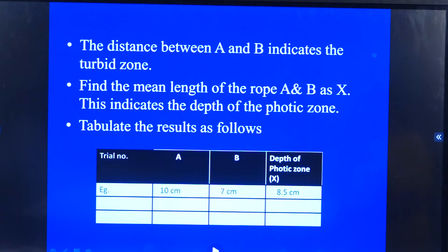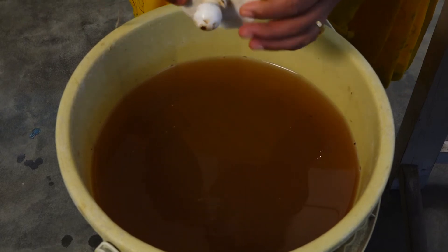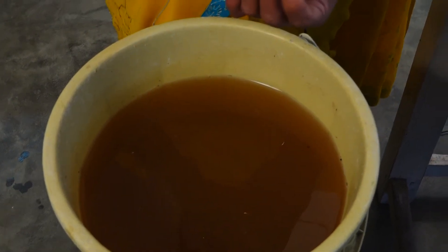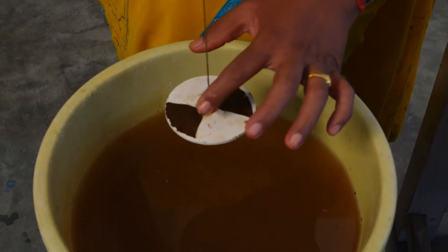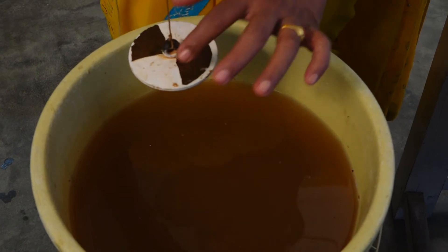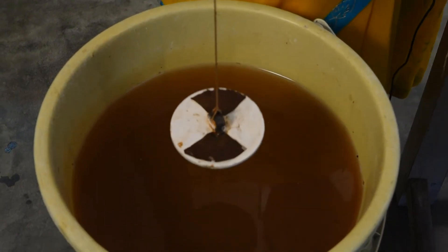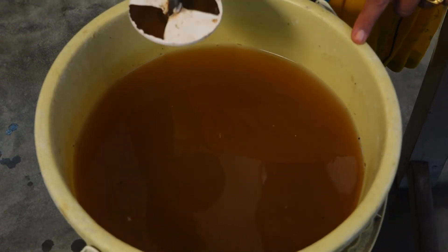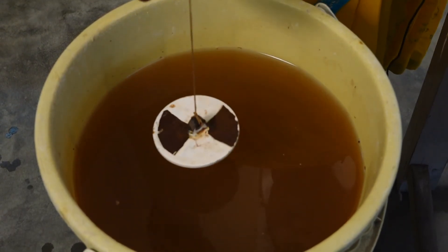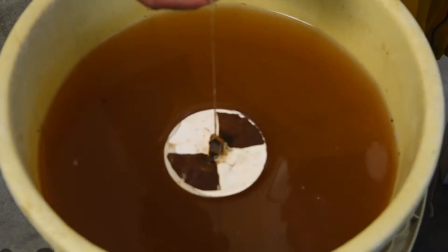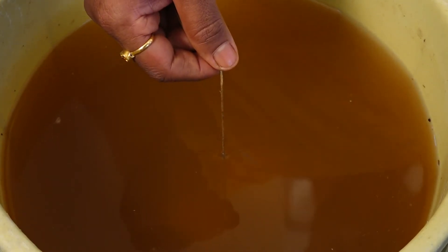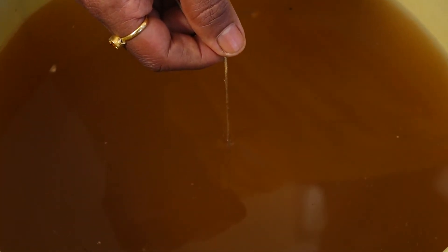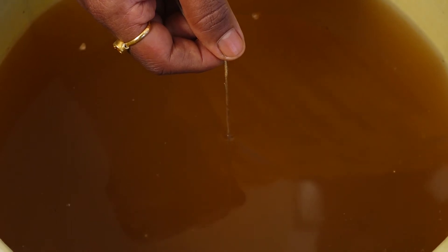We shall be conducting the experiment now. This is the Secchi disc — can you see? To one of the ends we have added the weights, and on the other end is the nylon thread. Alternating dark and light color has been painted. This is the pale of turbid water. I am just dipping the Secchi disc into the water. Keep observing. At this particular point, I am not able to see the Secchi disc.